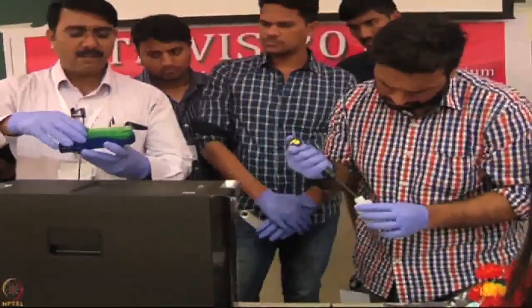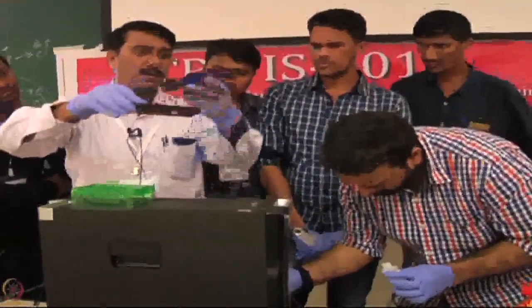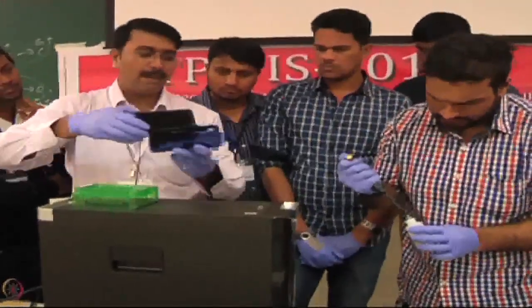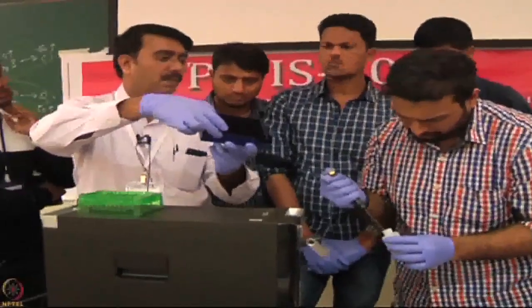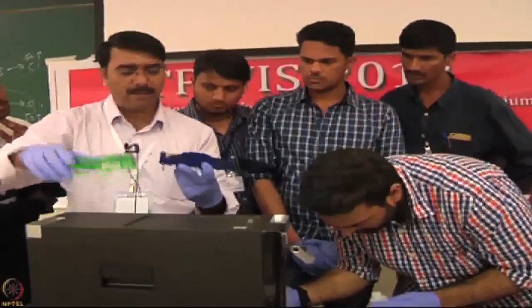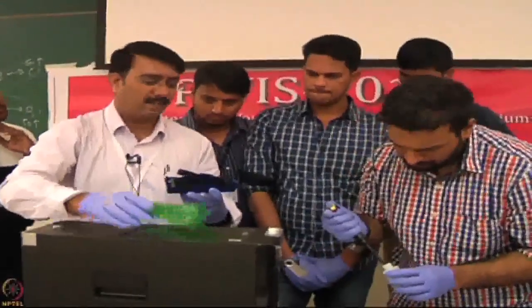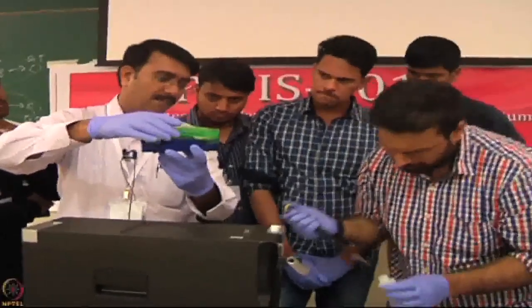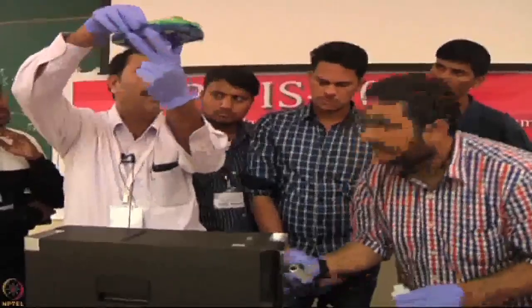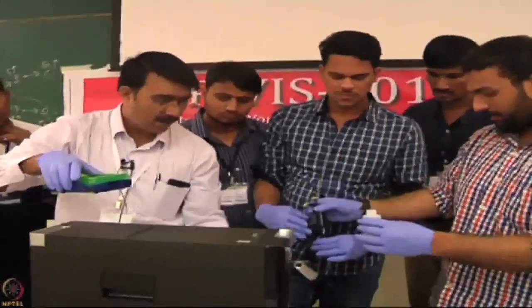Side by side, I have taken one more plate here. I had already added 200 microliter each of the same buffer. I'm placing this like this in the groove. So this is the sensor tray. It's a 96 well plate format once again. These are the 7 streptavidin sensors I had taken here, and I'm carefully putting them like this. I did it up to G. Then you can add column 3.